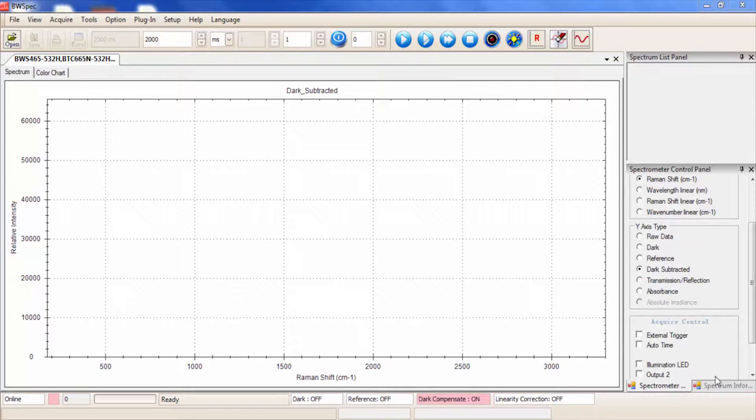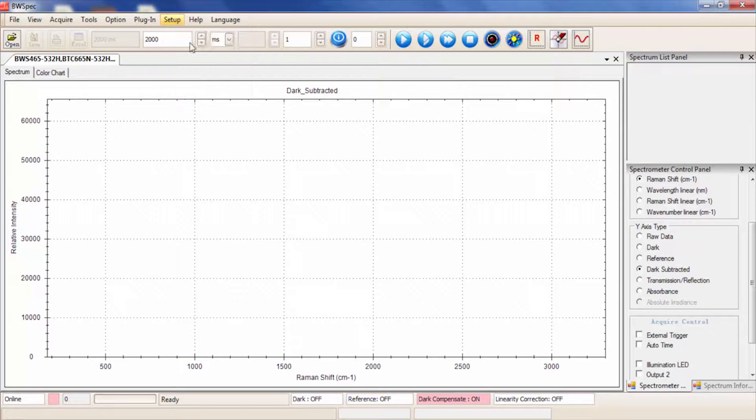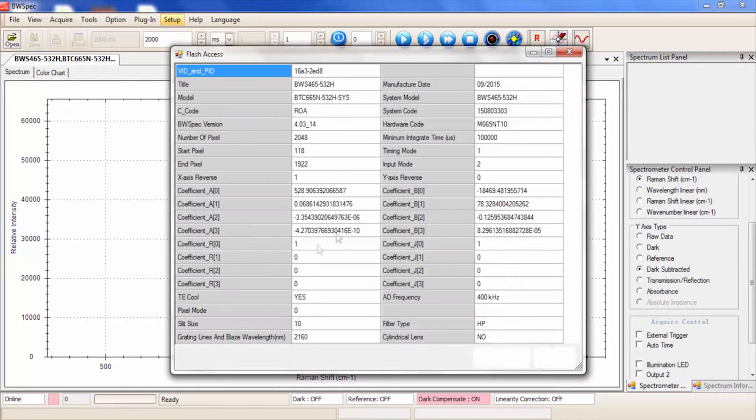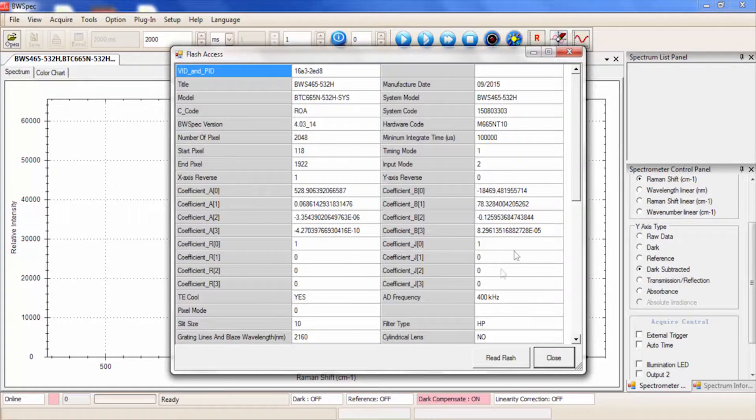On opening BWSpec software, your unit will show online in the bottom left-hand corner. You can view the details of the unit currently connected in Setup, Flash Access, and here it will read you the flash of the unit. You can also read the flash.